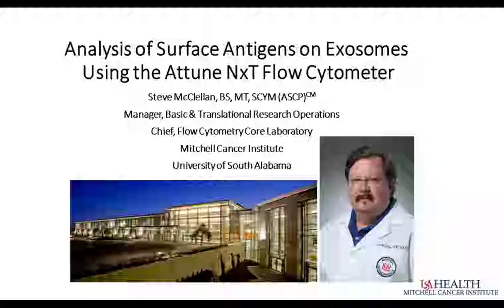Around the turn of the millennium is when we see the first reports of using flow cytometry to actually look at exosomes. And in the last 5 to 10 years, we've seen yet another explosion in those publications due to the improvements in the sensitivity of our instruments and also highly defined protocols to add rigor to this, what I consider to be a rather challenging field.